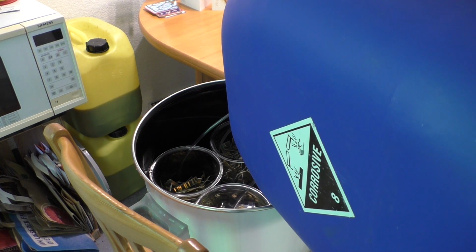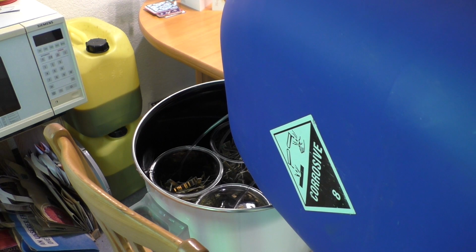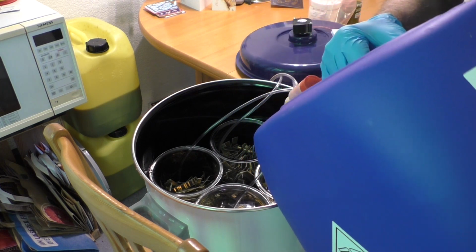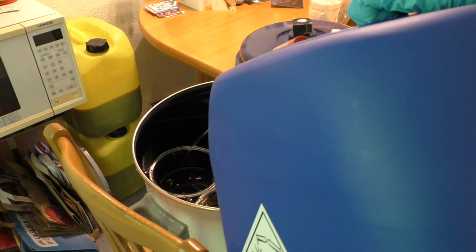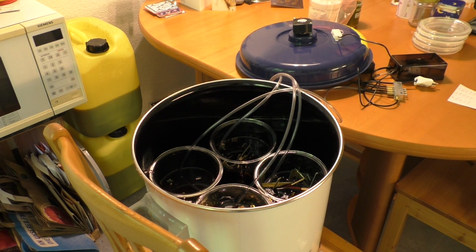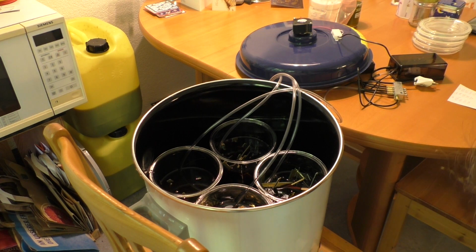Oops, was already open. I fill it up until everything is submerged. Okay, so I need some kitchen paper because I don't want this stuff to drop on my floor. As I said, it's not very dangerous, but it makes pretty nasty stains.